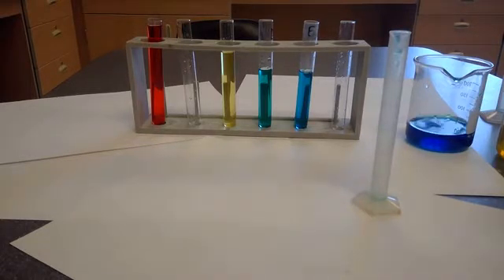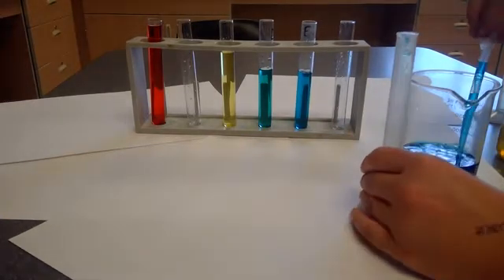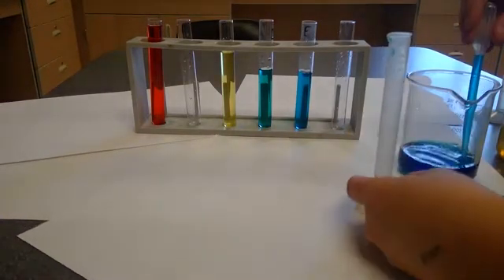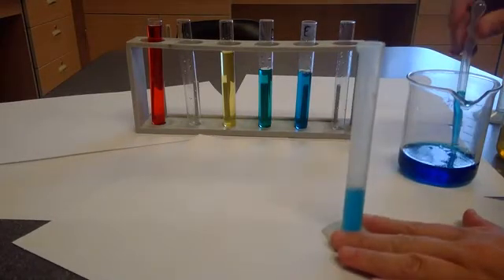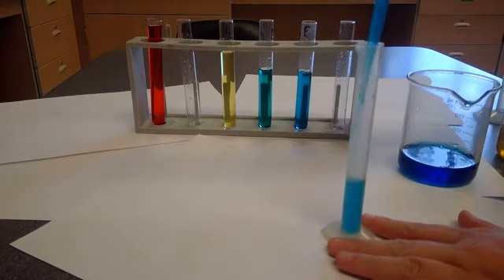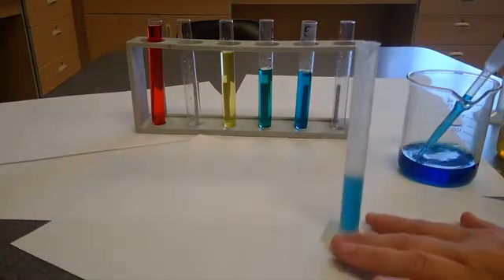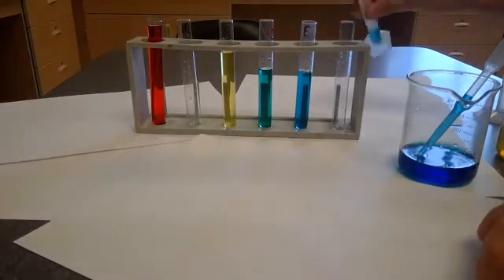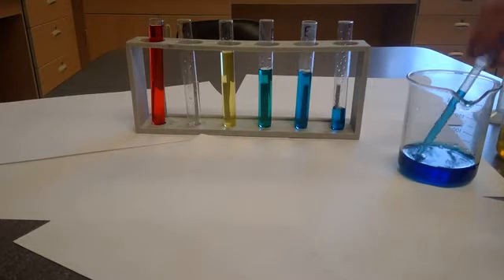Excellent, it's looking good. So now from the beaker of blue water right here, I'm going to take 4 milliliters and I'm going to put it into test tube F. So I need 4, which is going to be this line right about here. And again, I need to be as accurate as possible. And I'm going to look at that meniscus line. Looks pretty good. And I'm going to pour that right into here, making sure to get every drop. Excellent.